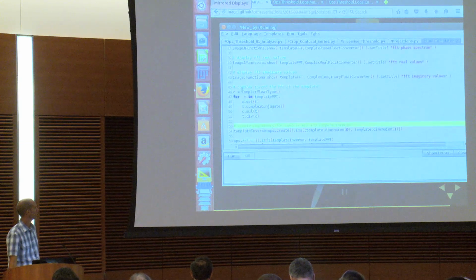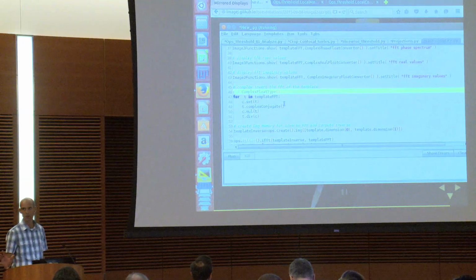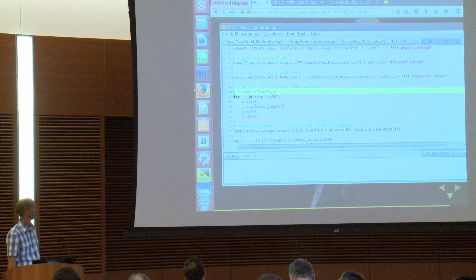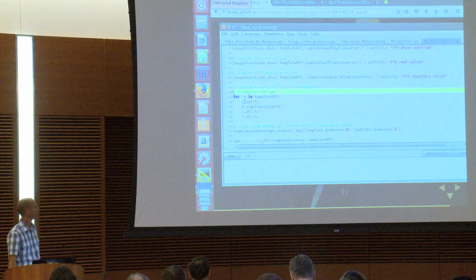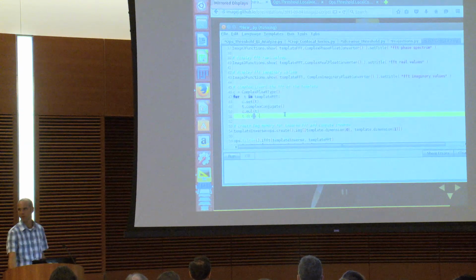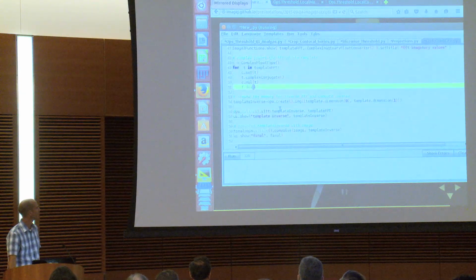If you ever look at ImageLib2 code, you'll see a lot of little loops like this. This is meant to be really generic. If I'm correct, this is how it gets its ability to deal with almost any type of number. If you ever look at the design of this, which is really great, there's a huge type hierarchy. Maybe sometime it'd be great to have an ImageLib2 talk at one of these events, just to learn more about all this stuff.